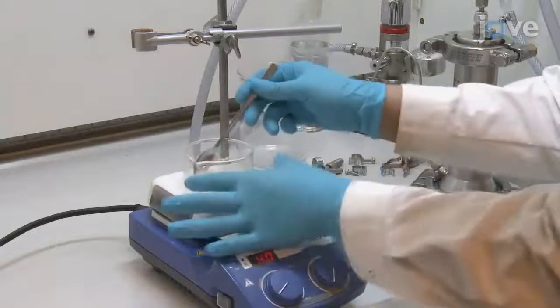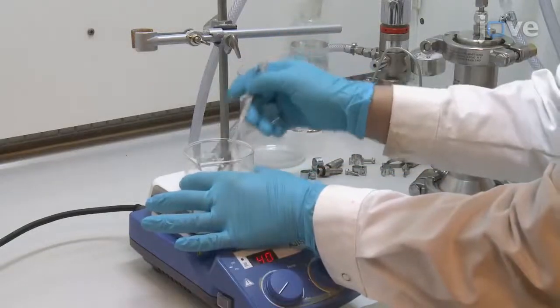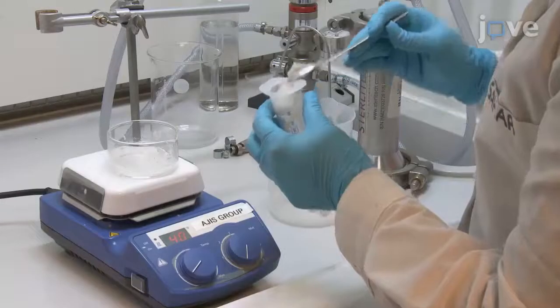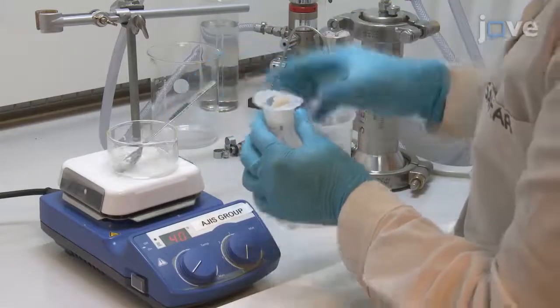Heat the mixture to 40 degrees Celsius and mix with a spatula until a smooth paste is obtained. Transfer the mixture into a 60 mL syringe.